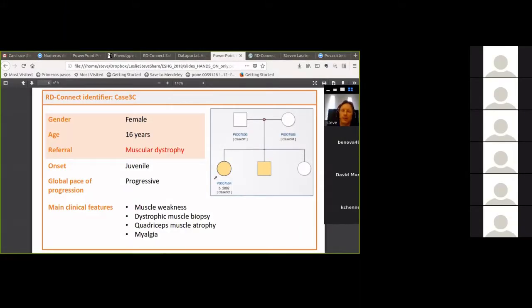This is a case we're going to look at today — it's not a real case, but one we've made up for these workshops. We're describing a 16-year-old girl for whom we have deep sequencing data from her and her parents. She has muscular dystrophy, with main clinical features including muscle weakness, dystrophic muscular dystrophy confirmed by biopsy, quadriceps muscle atrophy, and myalgia.